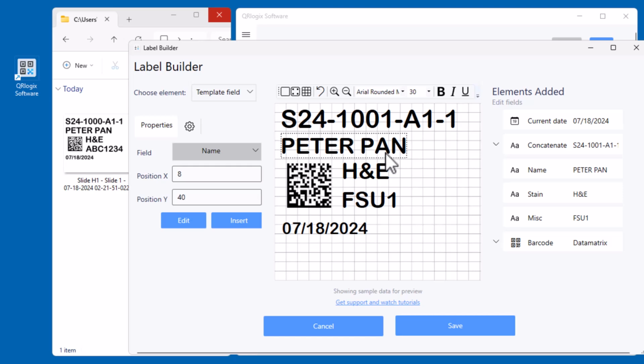Patient name, that's questionable. Some long names, like we talked earlier, will print off the end. That's why some people prefer, it makes a lot of sense to do last name, comma, first name, because the last name is going to be more important for identification purposes. But do what makes sense to you and your laboratory. But in this case, I'll just increase it for the fun of it. I'm just going to kind of move things around, make sure they all look good.